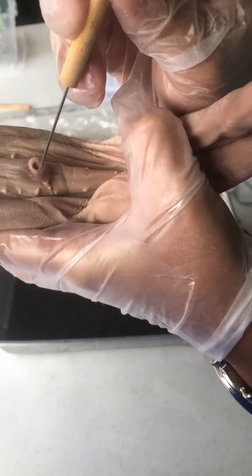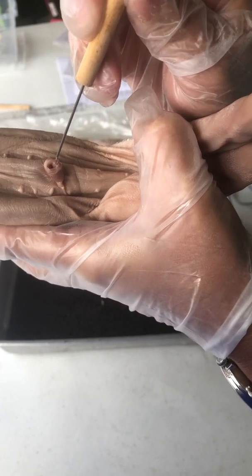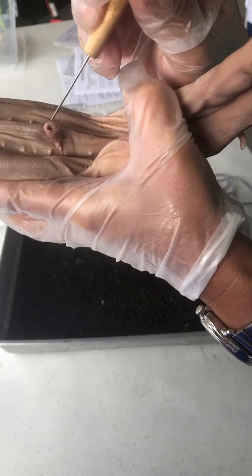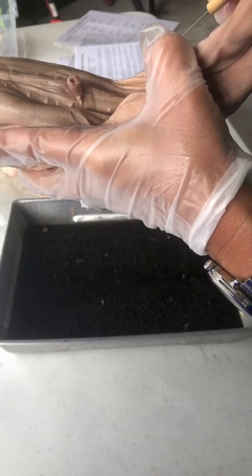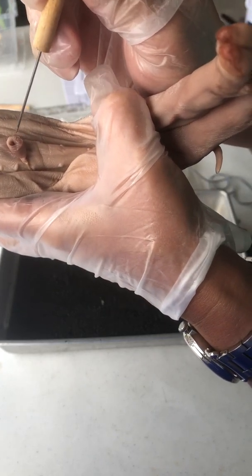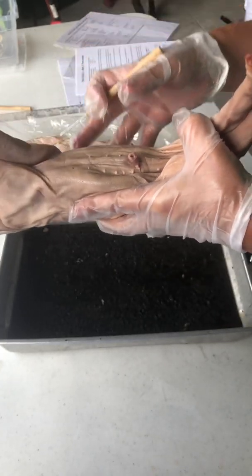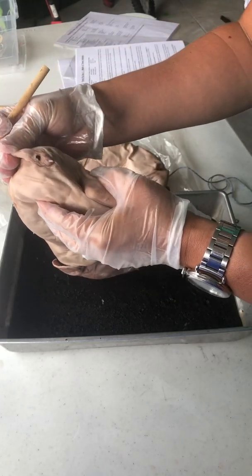So right here, you have a larger opening and then two smaller openings, okay? The largest opening is the vein, the umbilical vein, and it carries blood from the placenta to the fetus. And then the two smaller openings, this one and this one, are called the umbilical arteries, and they carry blood from the fetus to the placenta. Now we're going to lift the pig's tail to find the anus, which is right here.